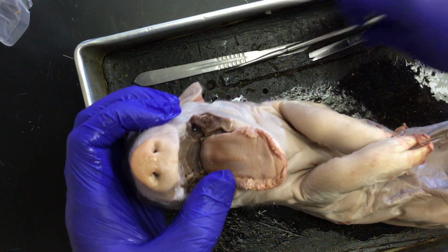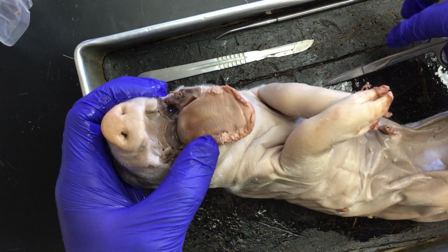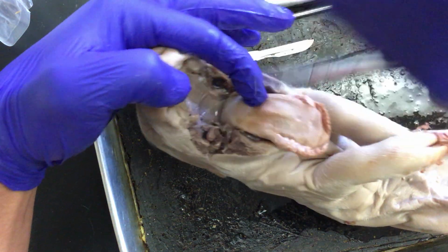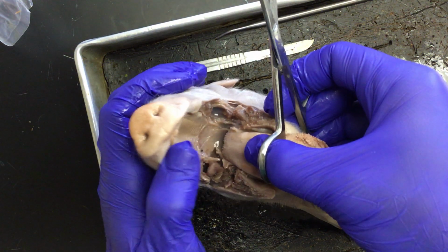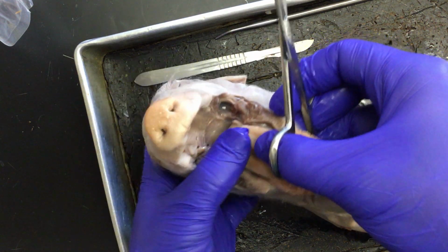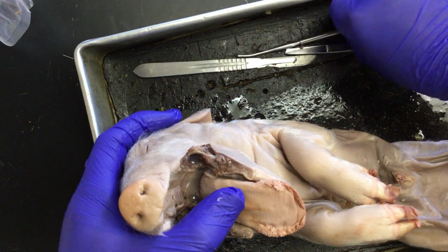I'm going to open up this oral cavity just a little further so we can take a look at a few more structures. Cutting through this pig's masseter right now. The masseter is the strong muscle that you have embedded in your cheek. When you bite your teeth and you feel that muscle flexing, that's your masseter. That is what gives you the chomping ability that we all use when we eat.